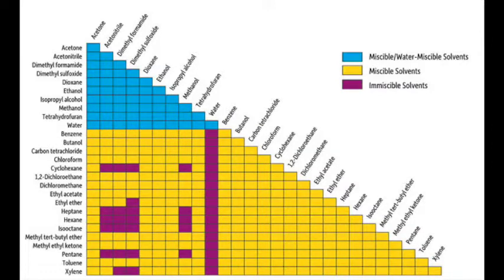So in the previous part of the movie, we saw that psilocin likes acetone and methanol and ethanol, but you can't use these to do the extraction. If you look at the miscibility table, you'll see that chloroform is immiscible with water, so you can do that extraction. And you'll see that ethyl acetate is immiscible with water, so you can make two layers using that. But you have to make two layers. And you can see that water makes two layers with lots of things. Ethanol doesn't make two layers with anything. Methanol really only makes two layers with hexane of the commonly used solvents for extractions.